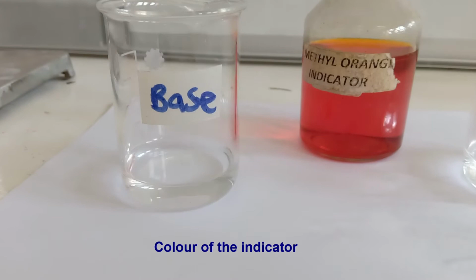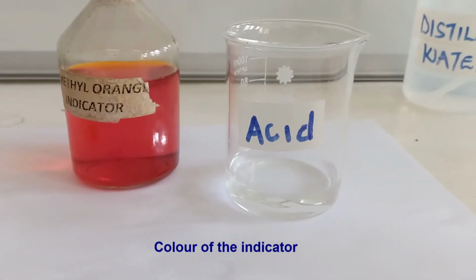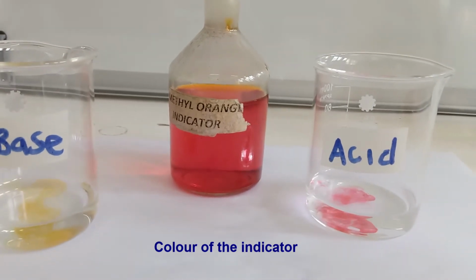When you are not sure of the color change of the indicator in a titration, add 1 drop of the indicator to the titrant, which is the acid in this video, and to the titrand, which is the base, and use the color as your reference.